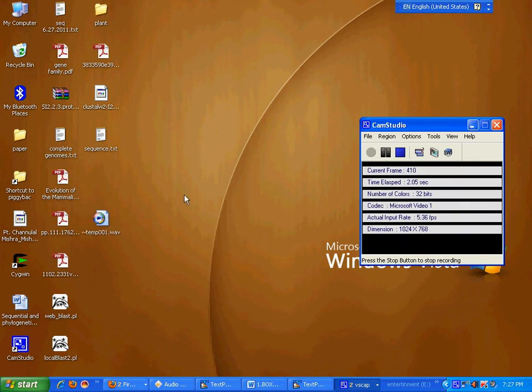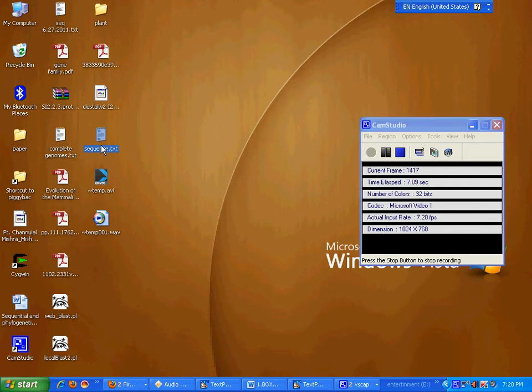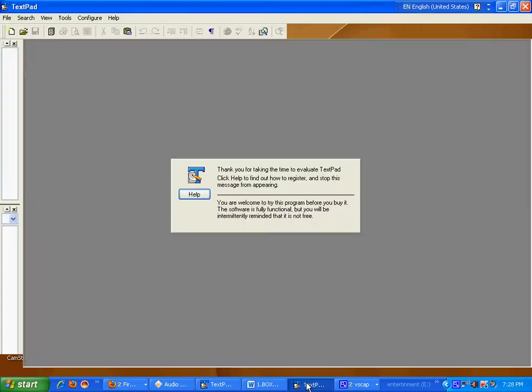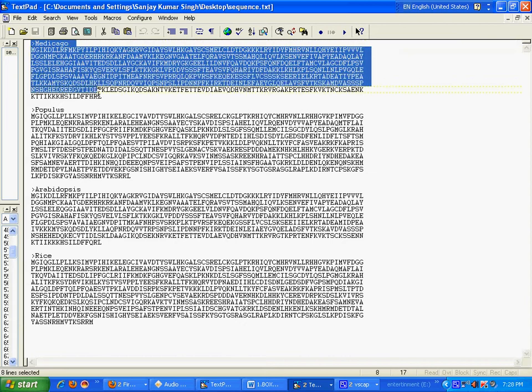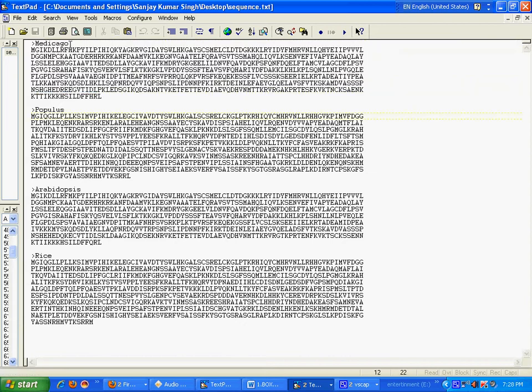Hi, today we will learn how to do multiple sequence alignment through ClustalW. This is my sequence file. Make sure that every sequence has a unique name like here.